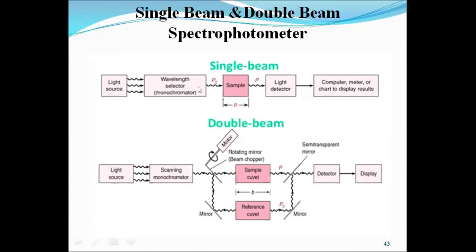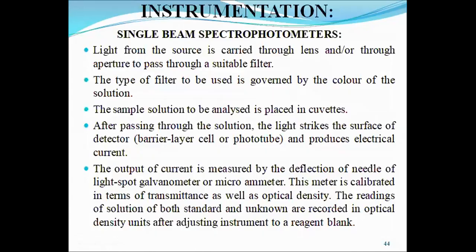So this UV spectrum will have better results, or will be a more authentic spectrum as compared to the single beam, because single beam has no such comparison with the reference, but here we can have the reference. The solvent in which the sample was dissolved, the absorbance of the solvent is also measured and thus detected. But in single beam, both absorbance of sample as well as the solvent is taking place together. So we get better results by using a double beam spectrophotometer.